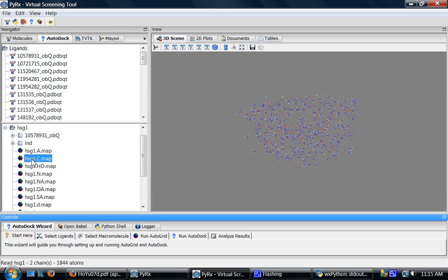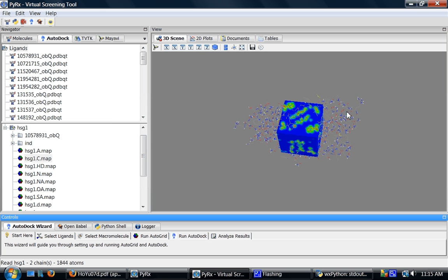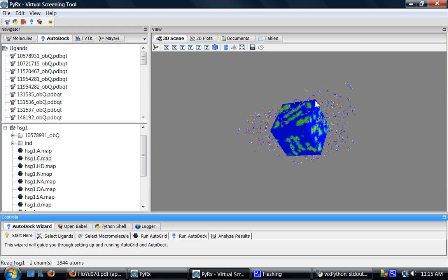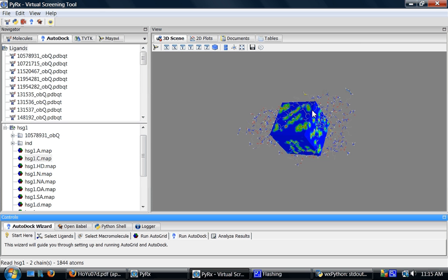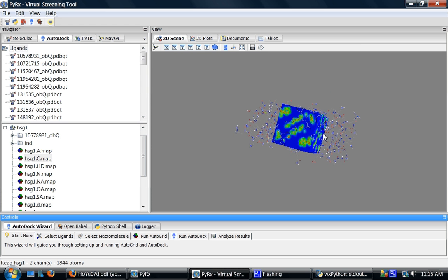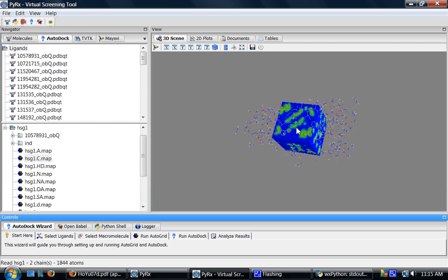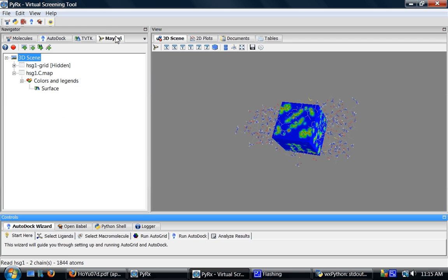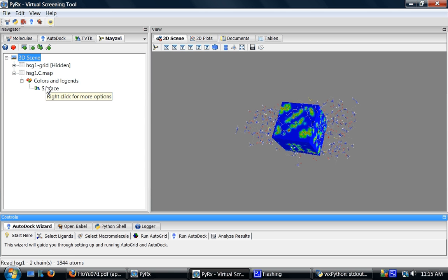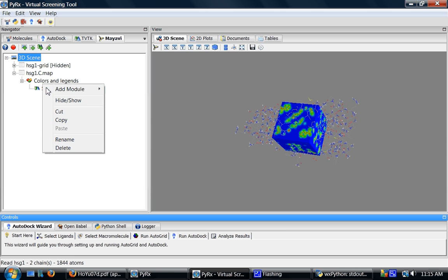And this would show the surface for the grid and it's outlined by default. I'll go to MayAVI tab and here you'll see this carbon atom maps. I'll right click on this surface and delete it.